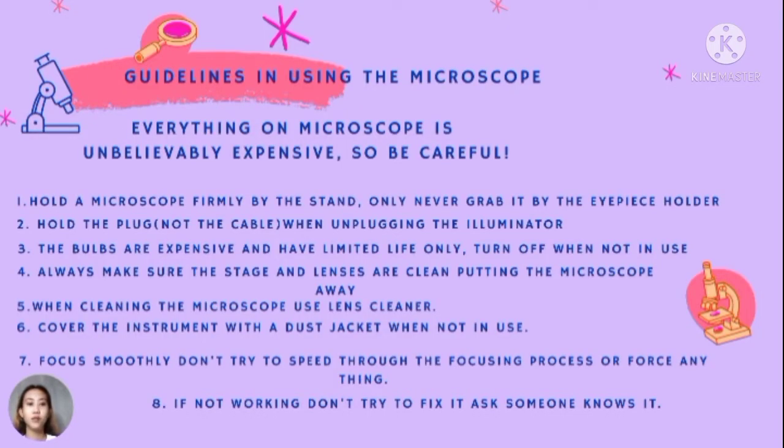My report is all about guidelines in using the microscope. Everything on a microscope is unbelievably expensive, so be careful. Number 1. Hold a microscope firmly by the stand only, never grab it by the eyepiece holder. Number 2. Hold the plug, not the cable, when unplugging the illuminator. Number 3. The bulbs are expensive and have limited life, so only turn them off when not in use.